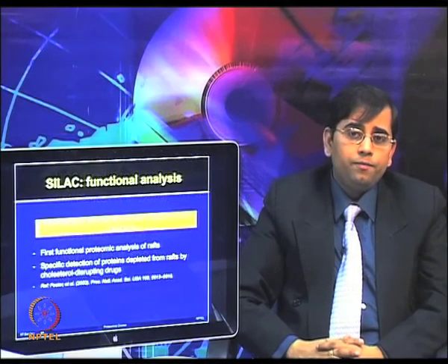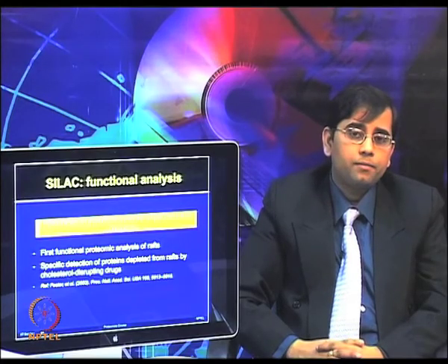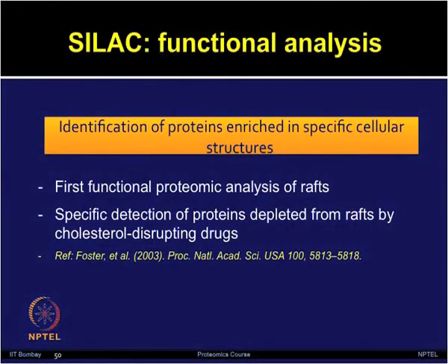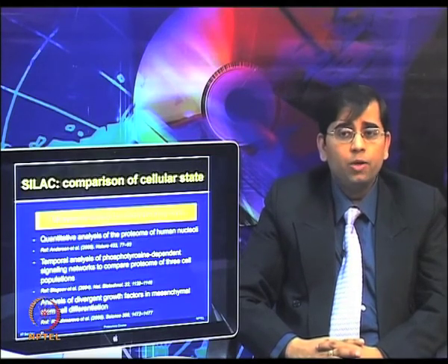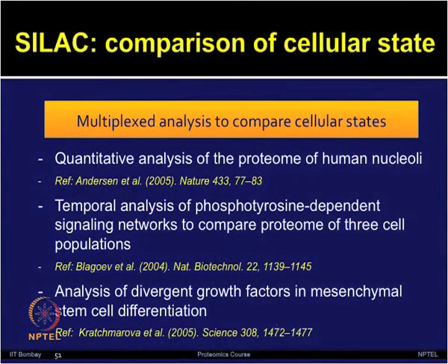The identification of proteins which are enriched in specific cellular structures. A study by Foster et al. used the first functional proteome analysis of rafts, and they showed the specific detection of proteins depleted from the rafts by cholesterol disrupting drugs. SILAC has been widely used for multiplex analysis to compare the cellular states. Anderson et al. showed the quantitative analysis of the proteome of human nucleoli.